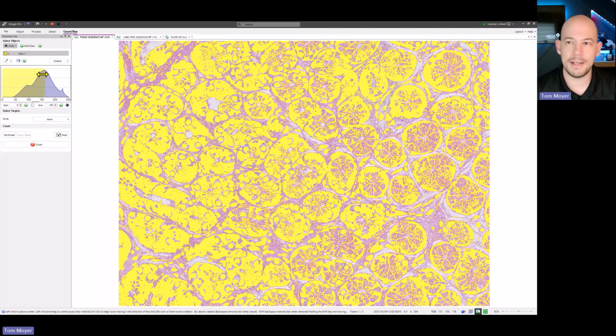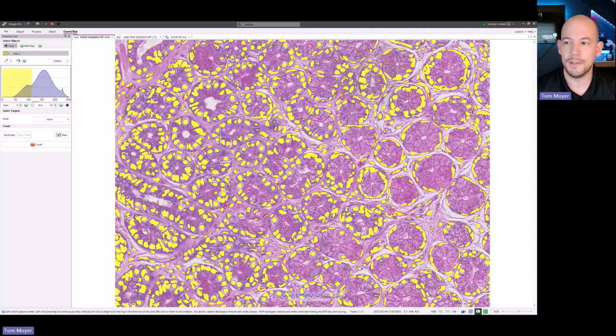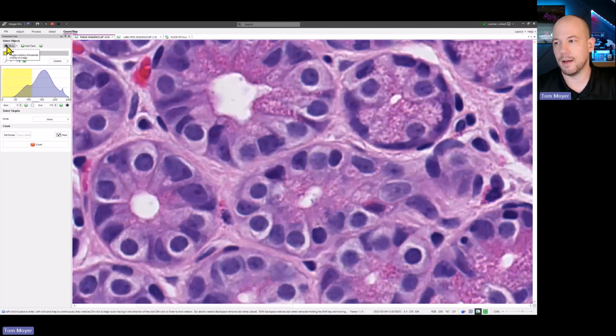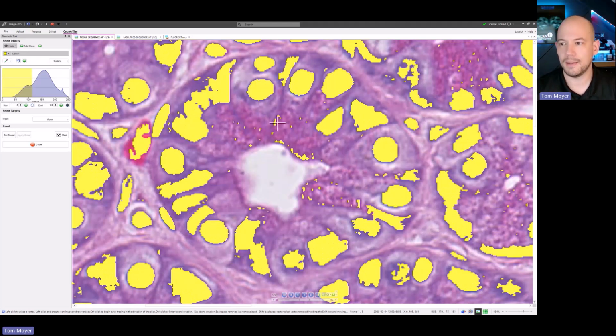But as you can see here, if I'd like to highlight maybe cells or nuclei within a region, because I have a higher contrast, I have these stained in blue, it's giving enough contrast between the red regions within the tissue that this would be an okay approach. But as you can see, based on what's highlighted within the image, I am picking up some single pixel regions.